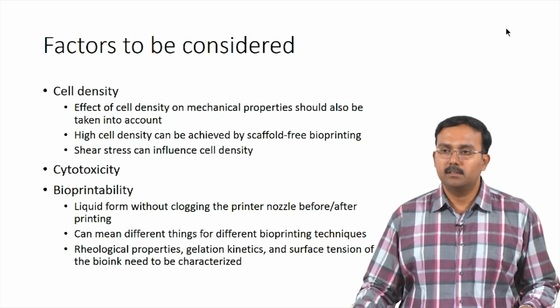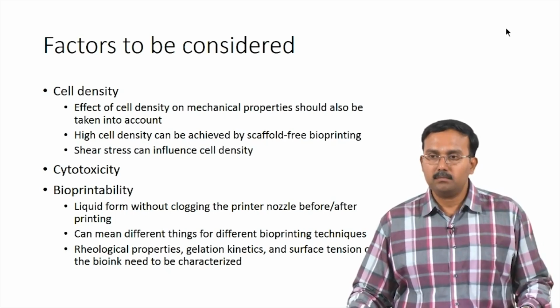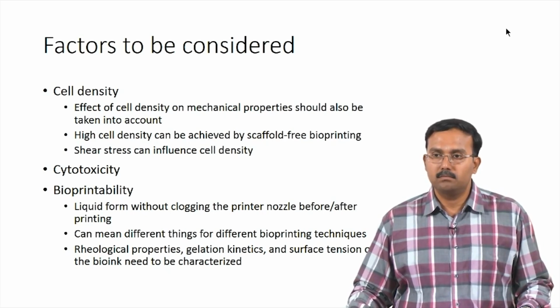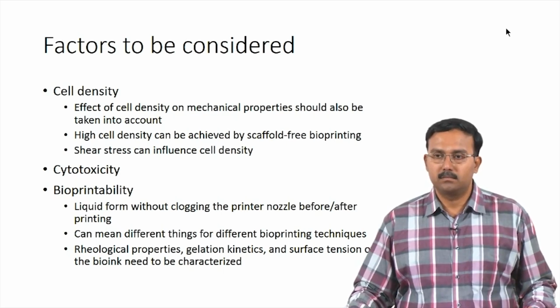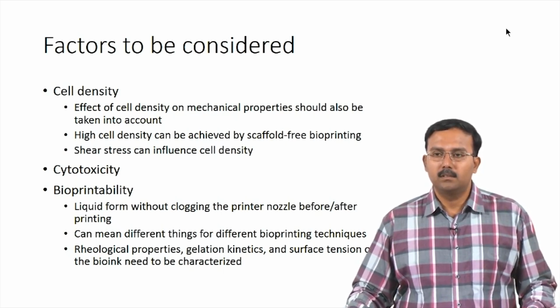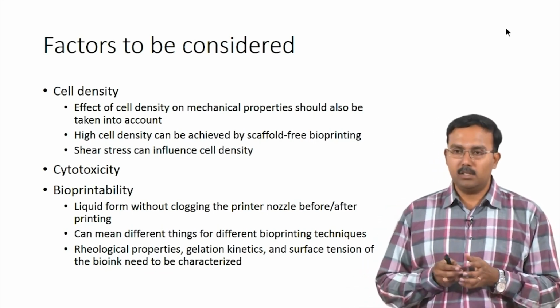You have a question? Regarding the printer nozzle, is it possible to engineer the nozzle instead of just the liquid, maybe pick a material or maybe the shape so that it doesn't stick? Isn't that possible? Because it will be at a small scale, so it will be dealing with those kinds of properties. Yeah. You can design nozzles in different ways.